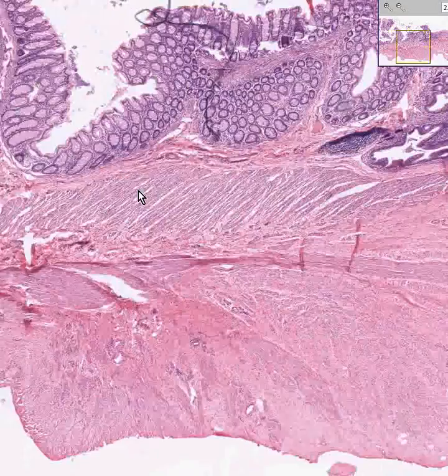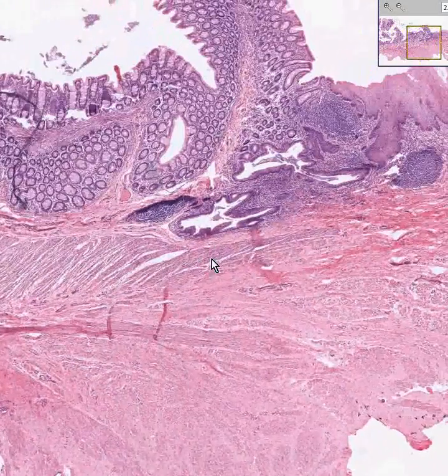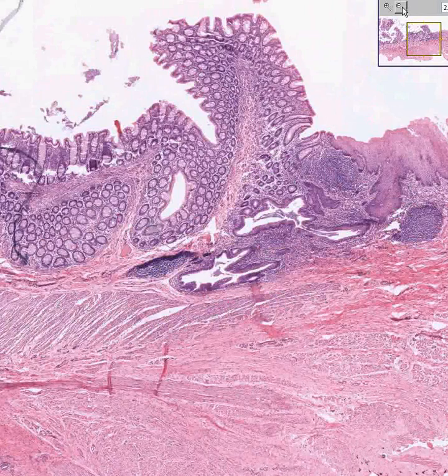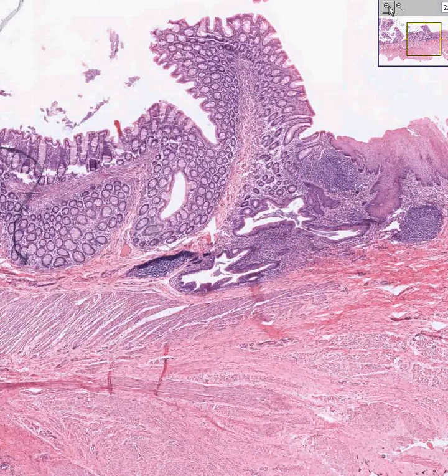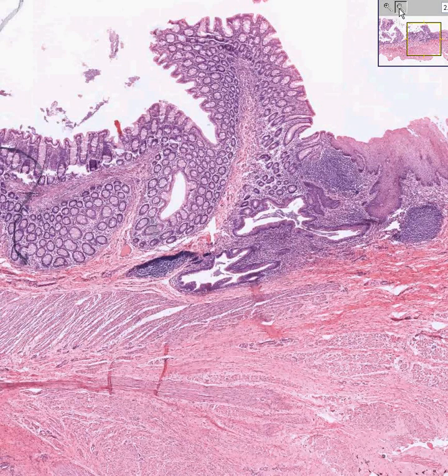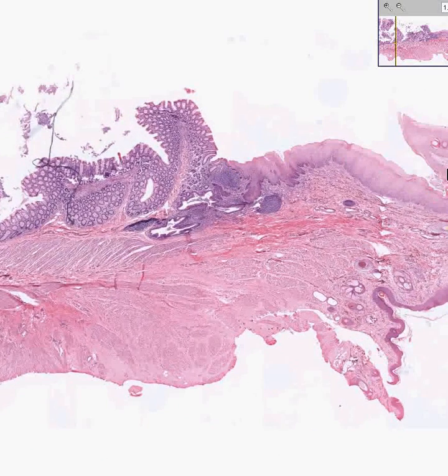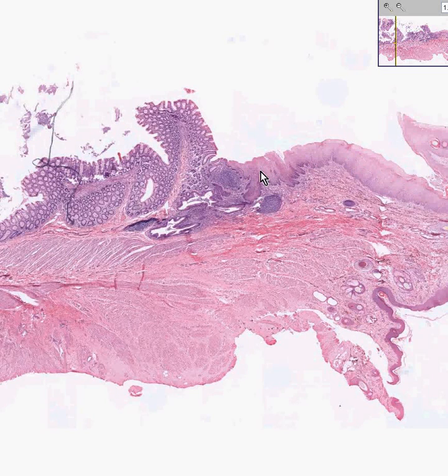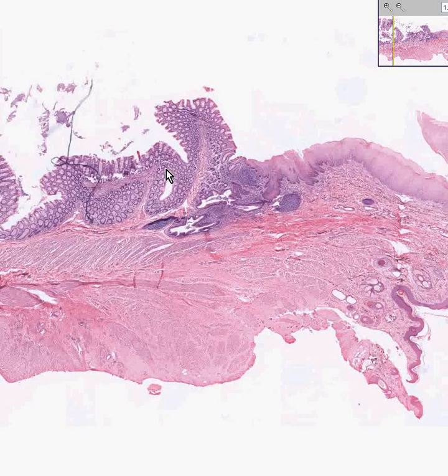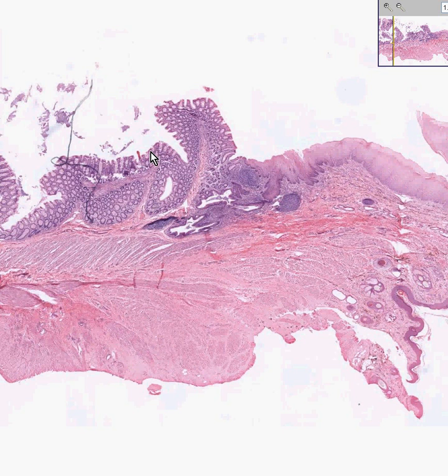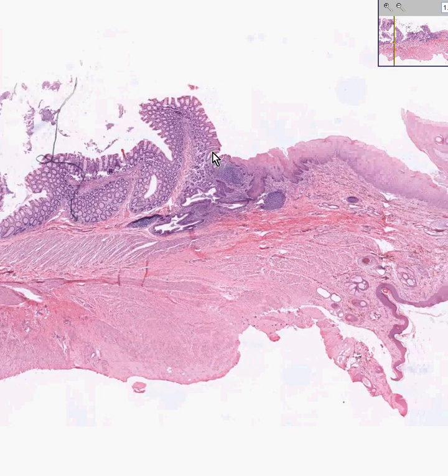The squamous-columnar junction is also extremely important embryologically because it has a whole different set of arteries, veins, and nerves. It is basically a collision between the gastrointestinal tract and the outer ectoderm. Grossly, the squamous area appears very shiny, thick, and leathery, whereas the columnar area oozes mucin and looks much more delicate because the epithelium is only one cell thick.